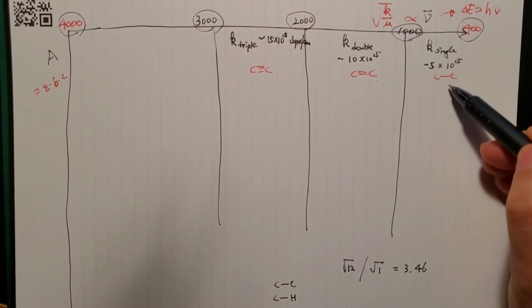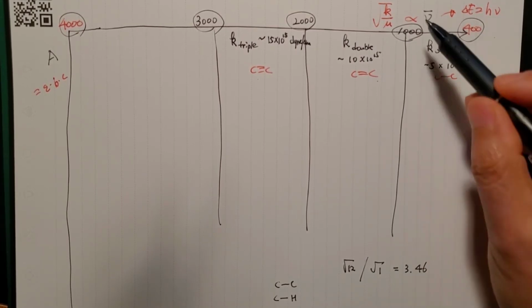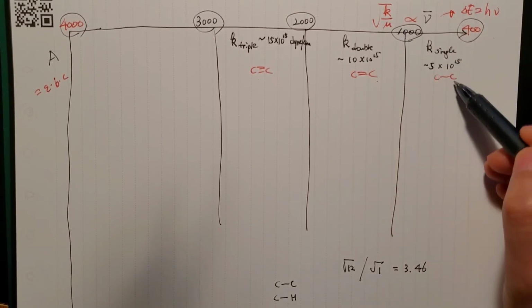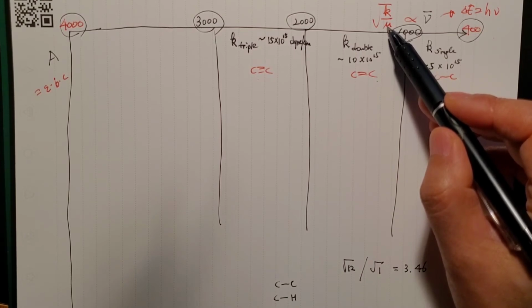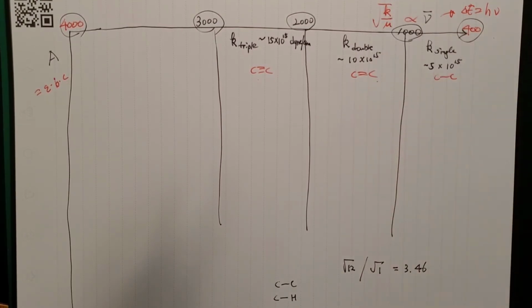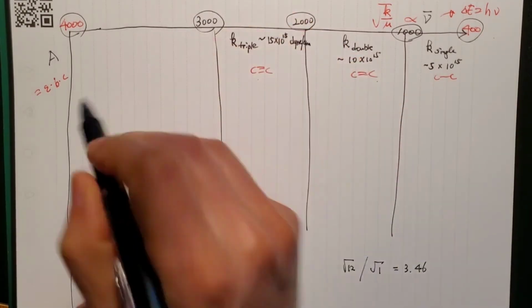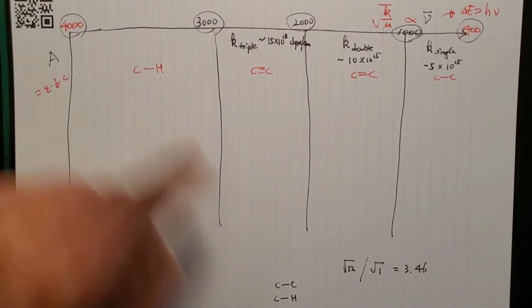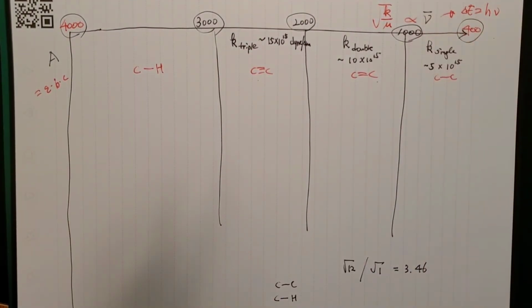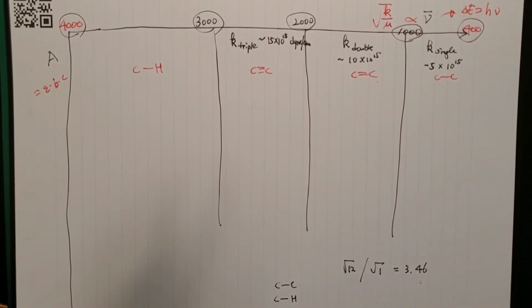So if you replace one of the carbons with hydrogen, then the frequency, due to the reduced mass, changes more than 3 times. When the mass becomes smaller with the hydrogen, 12 times, the value of the root will be about 3.5 times bigger. So a single-bonded carbon-hydrogen will appear here. You can see all the carbon-hydrogen signals come here, not due to the K value. There is a little change, but it's mostly by the reduced mass.